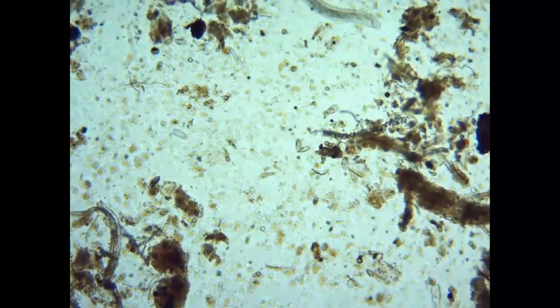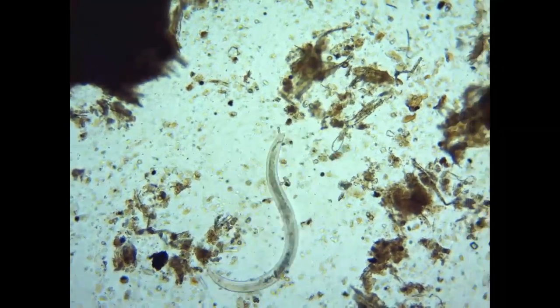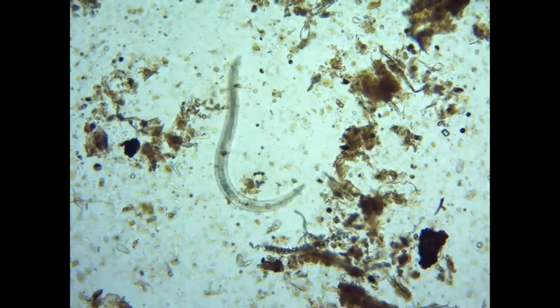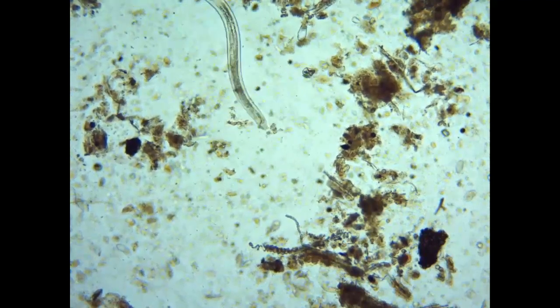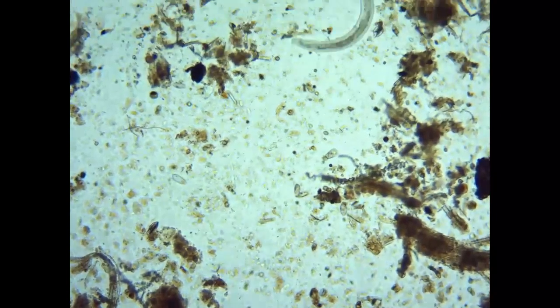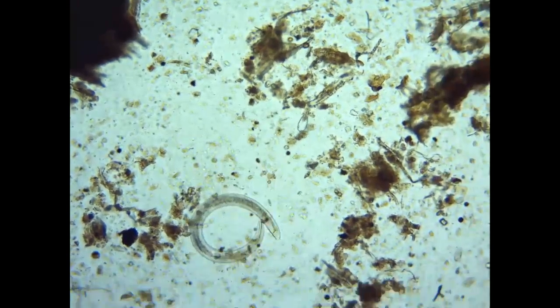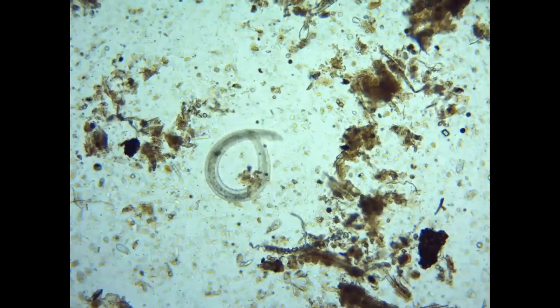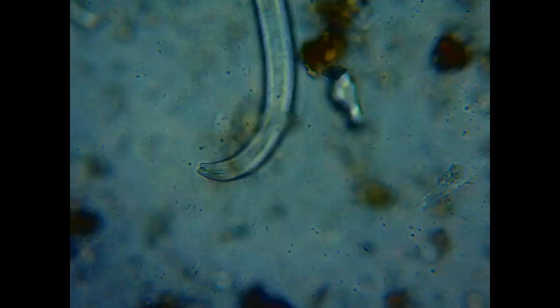When you first start looking at the life in the soil, you want to start at the 40x total magnification and look for nematodes. They're pretty obvious — they're usually squirming, and once you've seen one, you know what to look out for. Know that all nematodes are not bad; in fact, most of them are very beneficial. All nematodes can be grouped into one of four types. We'll start with the bacteria eaters. They have a mouth — sometimes they even have prominent lips. If it has a mouth on the front, that's a bacteria eater.